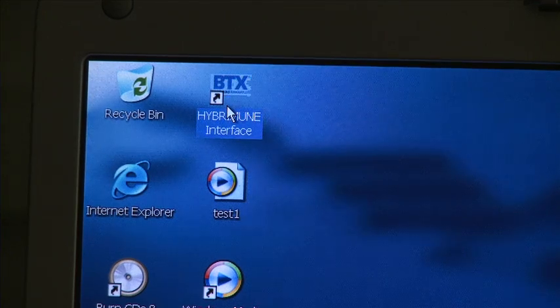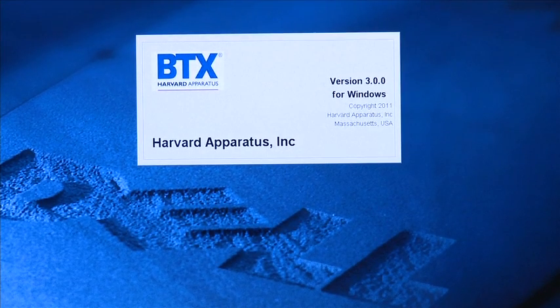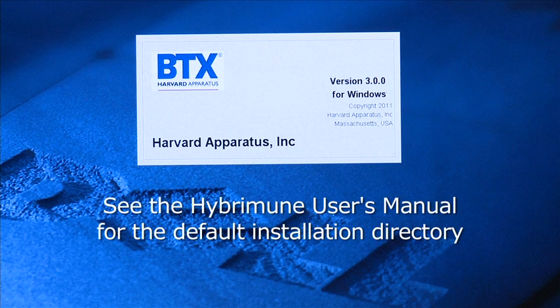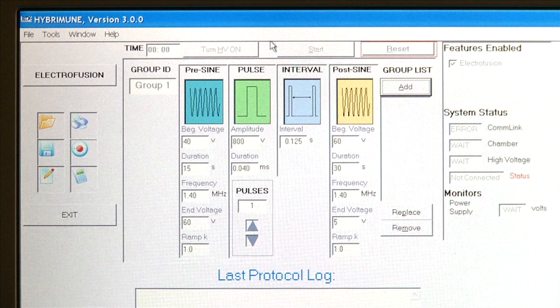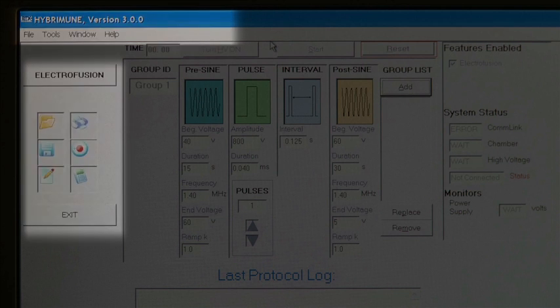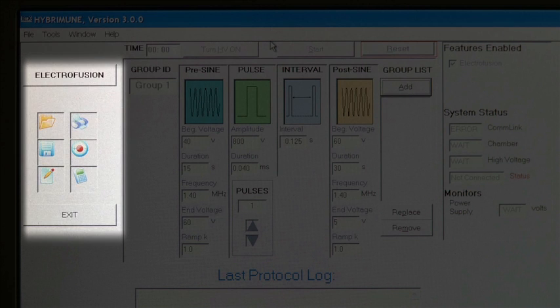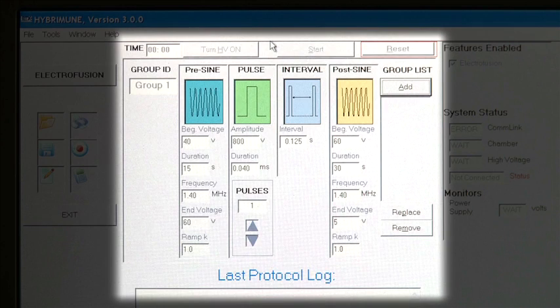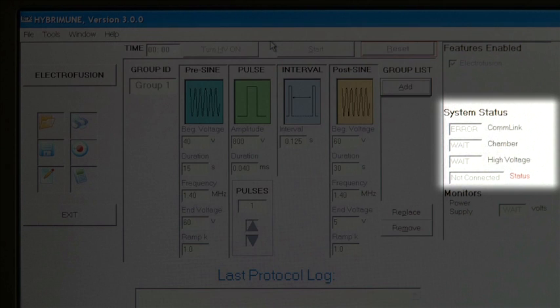The BTX HYBRAMUN interface desktop icon is now set on the user's desktop. Click on the icon to open the HYBRAMUN interface. See the HYBRAMUN user's manual for the default installation directory. The opening screen is divided into four areas within the main window: the title bar and pull-down menus on the top, the tool buttons on the left, the control panel for each operating mode in the center, and the status area on the right.